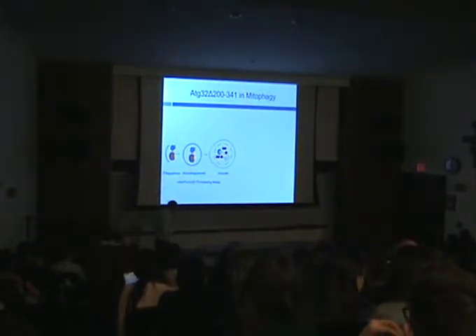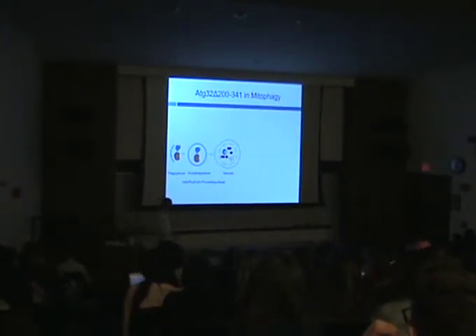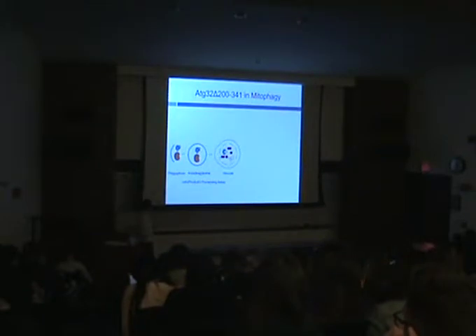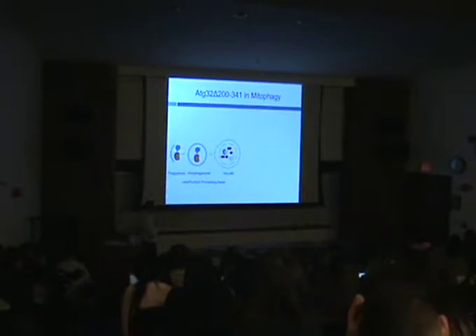So, okay, we found this domain. It's completely required. If you get rid of it, everything stops. But let's confirm that this is really true. And so we used a second assay. And this assay is really fun. This is an enzymatic assay.